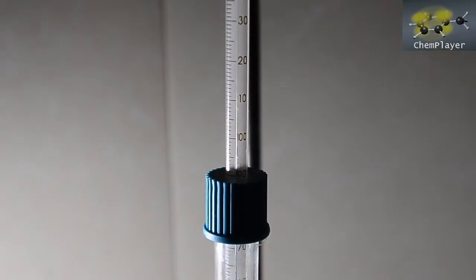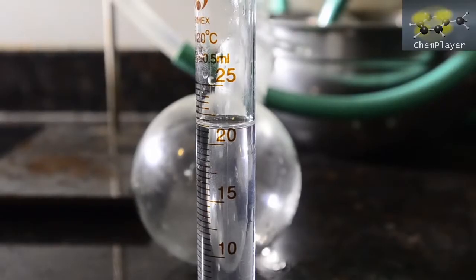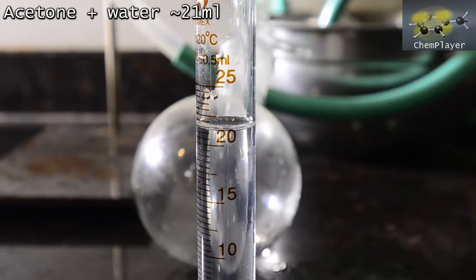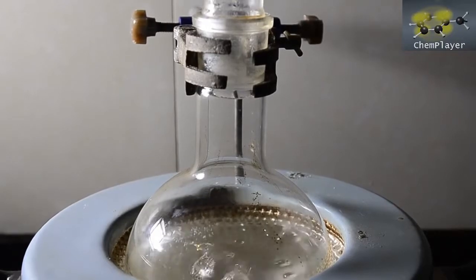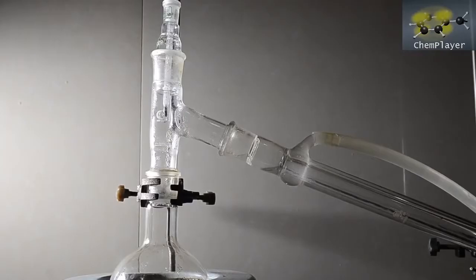Pretty quickly the temperature rises to 100 degrees. We've collected just over 20 ml of distillate, which is a mixture of acetone and water. So we keep going and distill off the rest of the liquid from the mixture. This boils at 100 degrees all the way to the end.